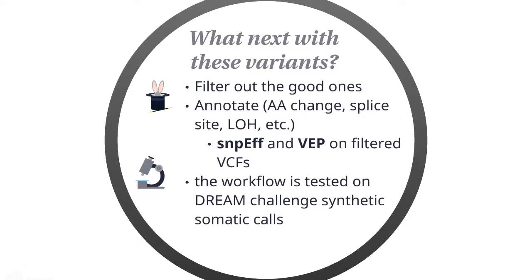And after getting the results, we have to filter out variants. And this filtering is more or less black magic, and we are trying to apply only really basic filtering, so that by the end of the day we are not throwing away that many real variants, at least hoping. Also, the users will get not only the raw VCF files, but annotated files by SnpEff and Variant Effect Predictor.